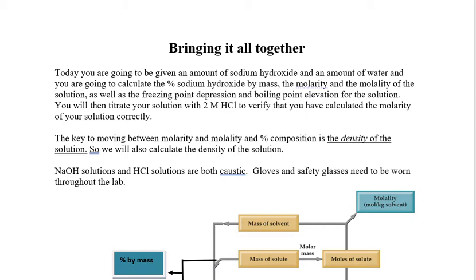Now, there's a couple other things that we're adding in this module. One of those is we're bringing in the idea of freezing point depression and boiling point elevation. For both of those, you're going to need to use your molality as your concentration.